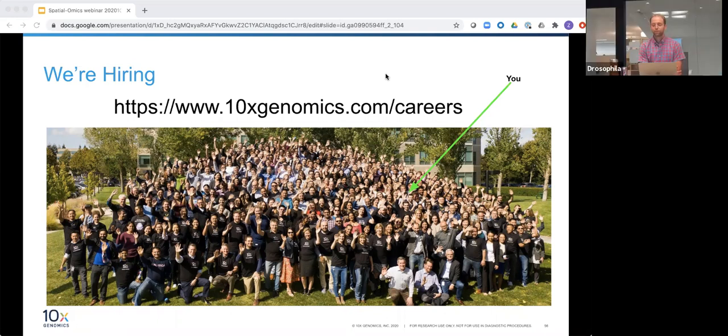Yeah, that's a really good point. You do need the thicker section. It could be a couple microns away from where you're taking that tissue for your Visium, so you could have additional cell types present there that aren't in your section, or vice versa. One thing you can do is look at other single cell data sets that are out there, compare those and get an average. We've seen people do that as a way to get around that. But you're right, in some cases you're just going to be missing a cell type based on location. So you could definitely think about inferring those cell types based on other data sets that are out there.